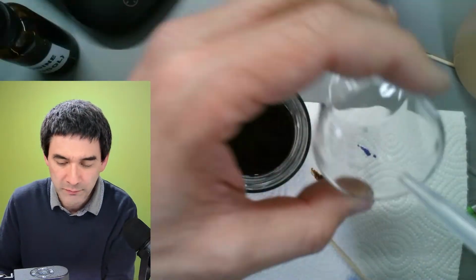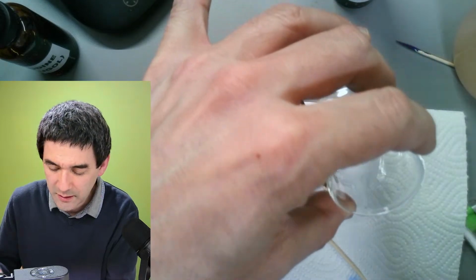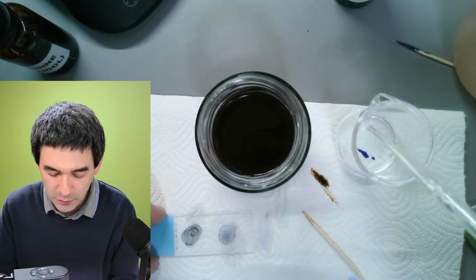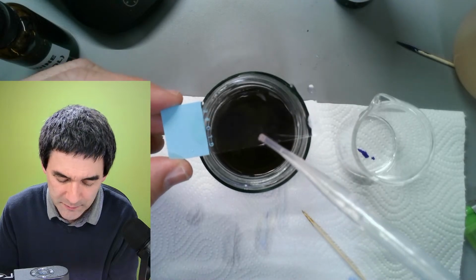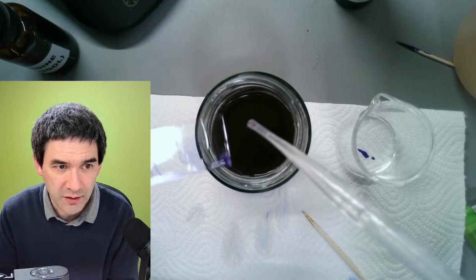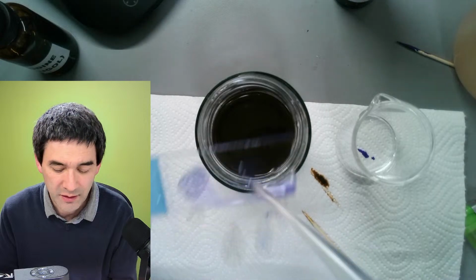Because I don't want to use too much of this alcohol, I decided to do it like this. I'm going to put some alcohol in here, and use a pipette simply to save a little bit of the alcohol. And look what happens if I add some alcohol over here and also over here. You can see that it kind of turns blue again. You can see how it's being washed out.